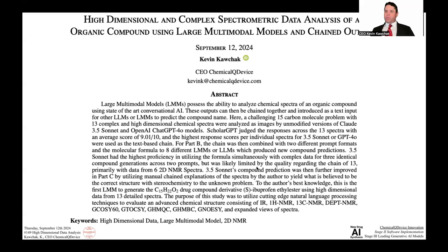So 3.5 Sonnet, which is an AI model, their prediction was then further improved in part C by utilizing manual chained explanations of the spectra by the author to yield what is believed to be the correct structure with stereochemistry to the unknown problem. To the author's best knowledge, this is the first LMM, large multimodal model, to generate the C15H22O2 drug compound derivative S-ibuprofen ethyl ester using high dimensional data from 13 detailed spectra, which I'll show on the next slide.